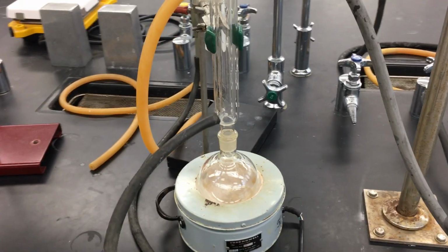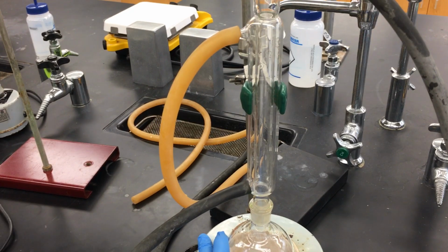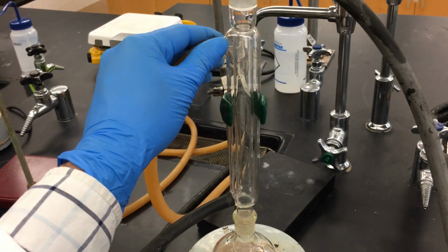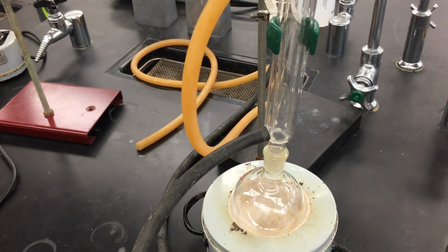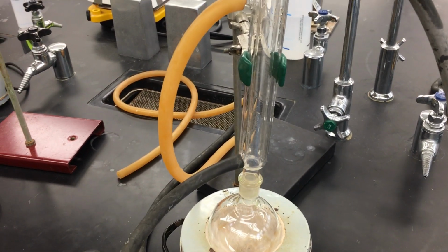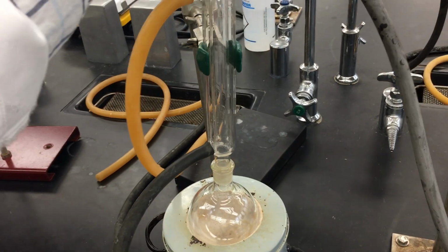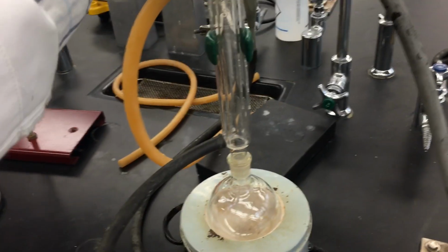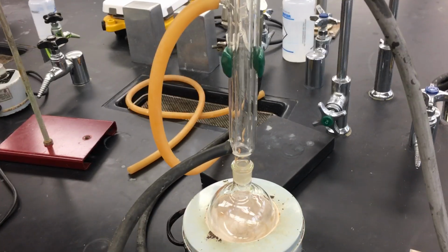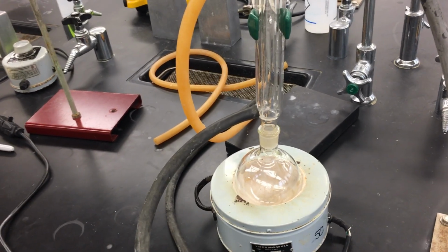In your lab notebook, I expect to see the physical constants such as the densities, the boiling points, the melting points, and other data concerning the hazards of all the solvent as well as the solutes that we are using in this reaction, especially bromobutane and butanol. The boiling point of butanol is much higher than the boiling point of bromobutane. Bromobutane is practically an alkane with a substituted halogen in it. Hence, we expect it to have a low boiling point. While butanol, being an alcohol, participates in hydrogen bonding. As a result, we expect the boiling point of butanol to be much higher.